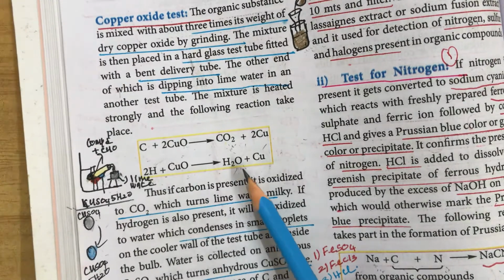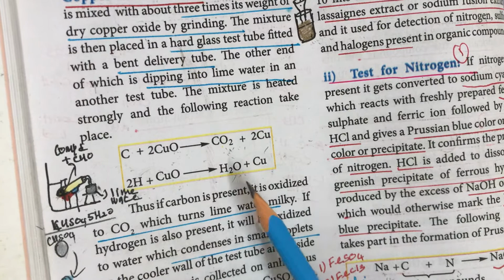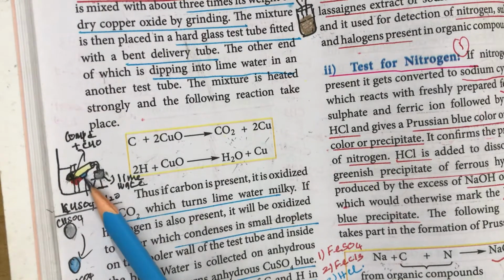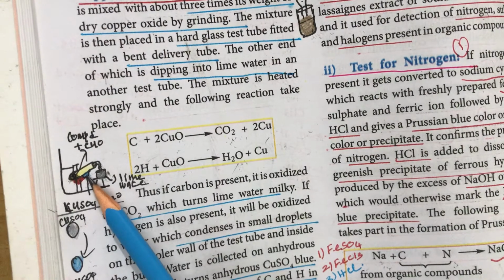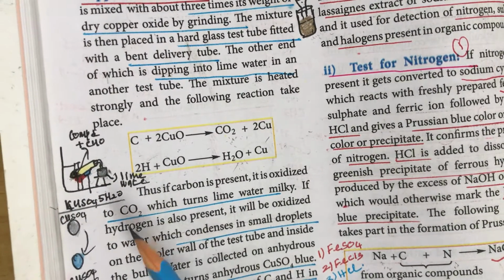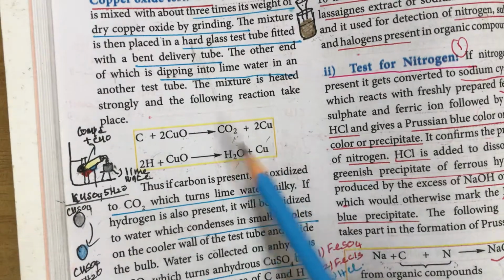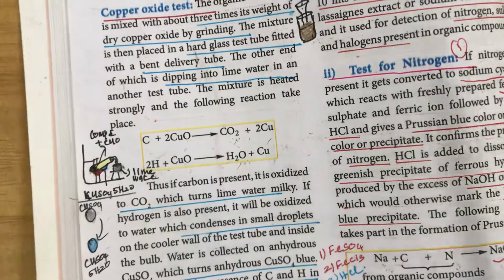The water changes the colorless copper sulfate into colored copper sulfate, because the evolving water reaches the copper sulfate kept at the side of the bent tube and changes its color. The change of color from colorless to colored copper sulfate with water of hydration, and the turning of lime water milky, show the presence of carbon and hydrogen in an organic compound.